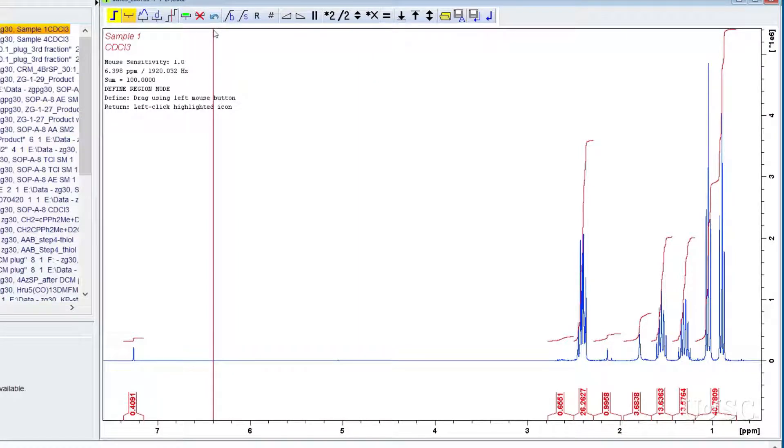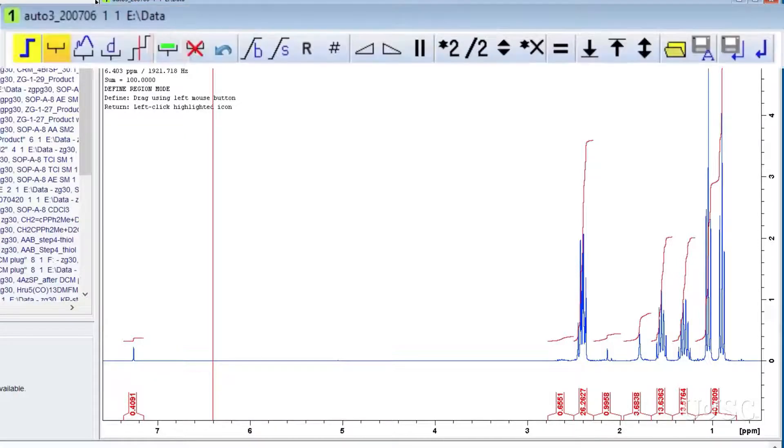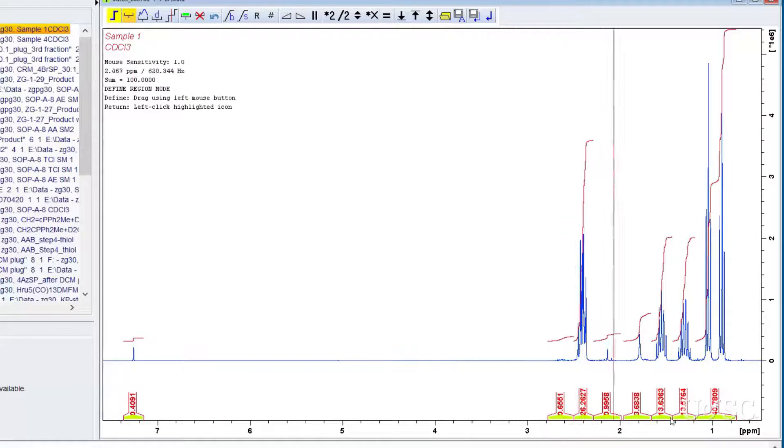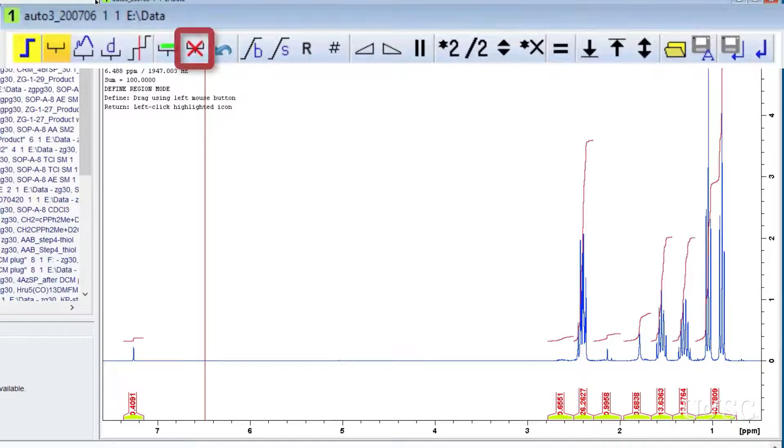If you want to delete all the current integrals you first have to select them. To do this click on the icon with a bracket around a green rectangle. Once selected you should see green highlights at the bottom of the integral regions under the displayed spectrum.